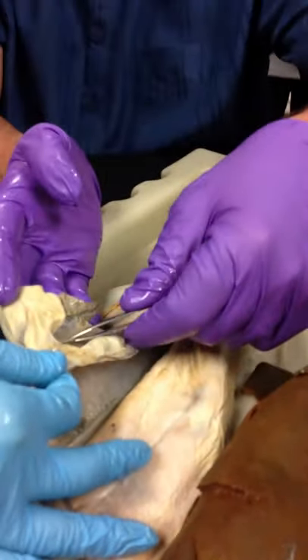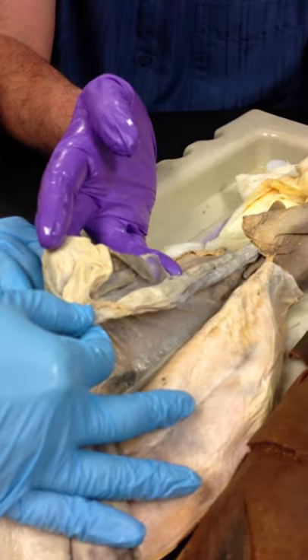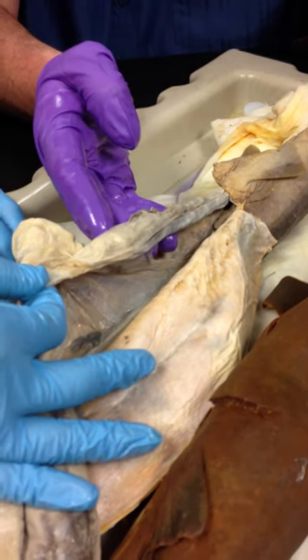And then one of them in the mesentery. So this membrane that we're fighting with is called the mesentery. And then starting right about here and then going all the way down here is a structure analogous to the intestine. And it's called the ileum. But it looks pretty short, right? It's kind of a short ileum for how could you get all your digestion done in that?